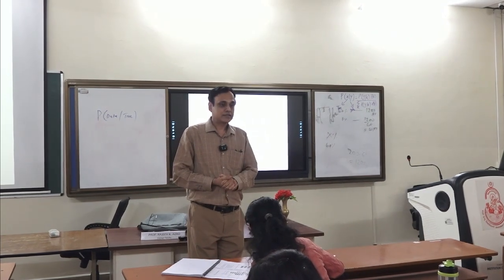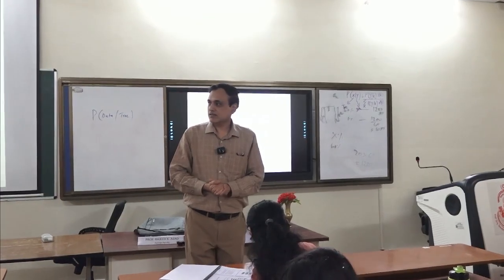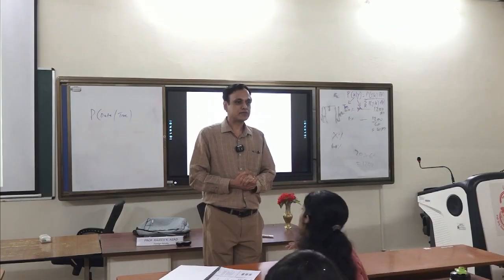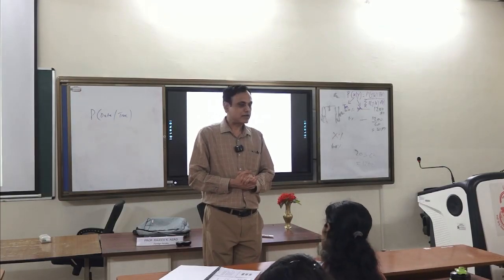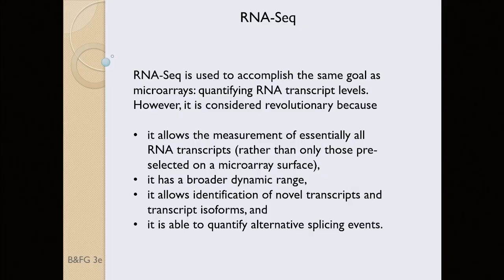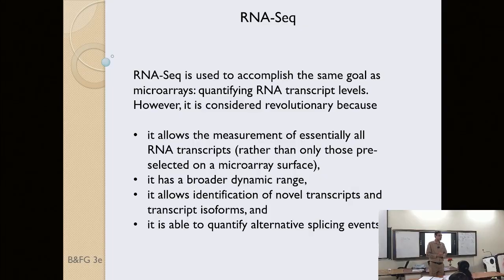RNA sequencing, or RNA-seq technology, is a relatively recent technology. Before that, microarray technology was used, but it was replaced within maybe 10-15 years or so. When I say soon, I am thinking about the time scale on which technologies are replaced. It got replaced by RNA-seq because this technology is really very powerful and very useful.